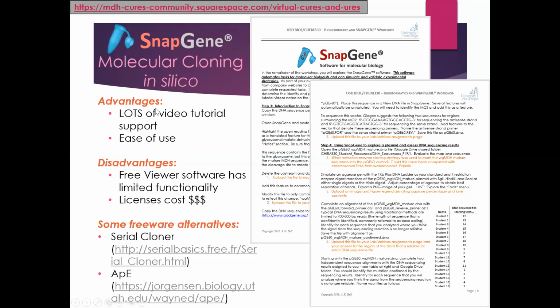So different things there. A couple links here for some freeware. The Serial Cloner, it has a really good website. It does a lot of the same things that SnapGene does, but it's free. You can use it on Linux, Mac, and PC, and so it's cross-platform.